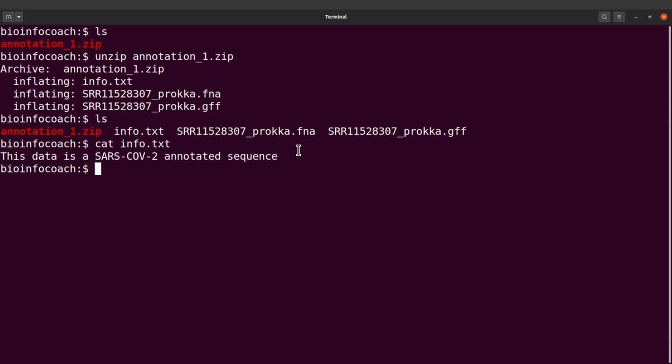We also have this .fna, which is a FASTA file, which has a FASTA sequence, and we also have a GFF file here. Basically, what I did in that tutorial was to annotate a sequence. The sequence that was annotated is what is found here, and the features are the ones found here. So we are going to visualize by loading this and then this into jbrowse and look at what will be displayed for us. That's what we are going to do next.